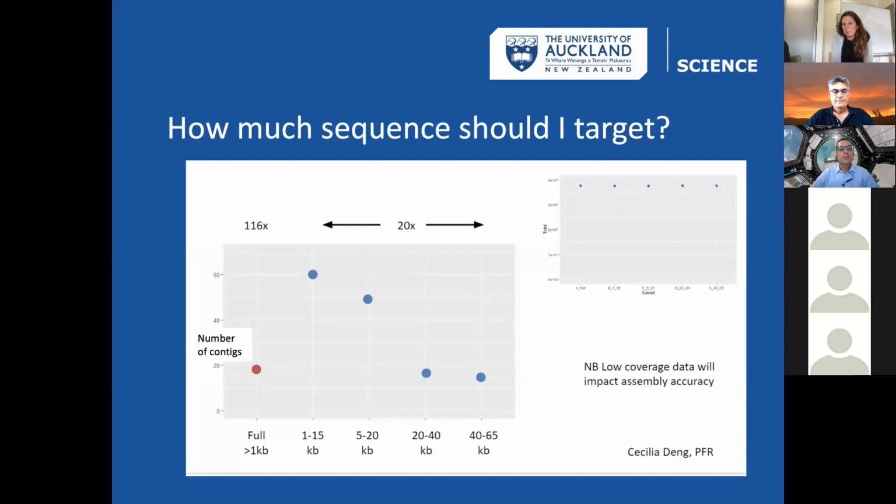We often get questions about how much sequencing I should try to get for my assembly. In Illumina type experiments, that's often quite a straightforward answer. I really just want to flag here that it's not just sequence quantity, but also the length distribution of those sequences that has some impact on the outcome. This is a yeast genome assembly to illustrate that.